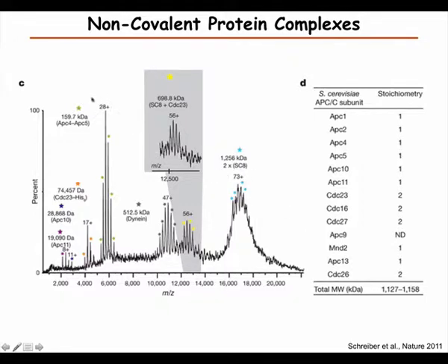But then when we have fragmented, we see that we have much better resolution, of course, when we get down to single subunits of proteins.